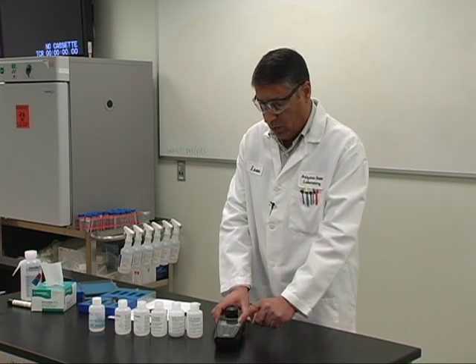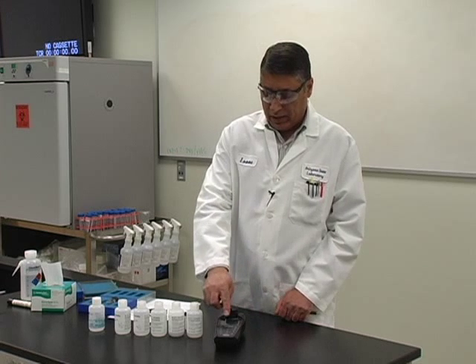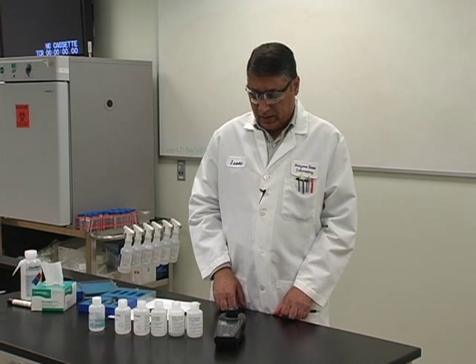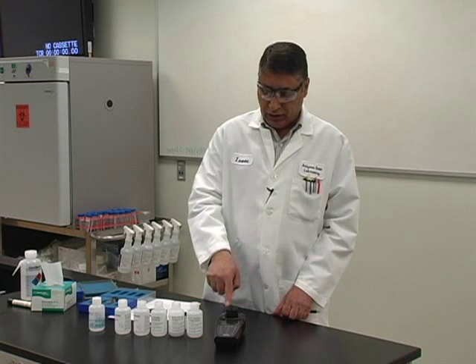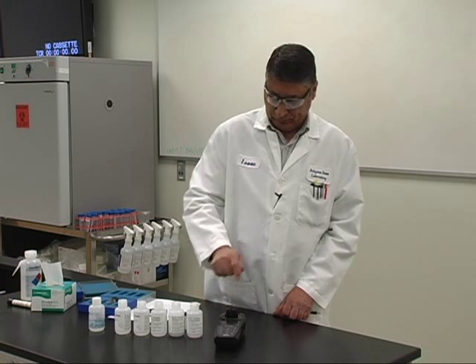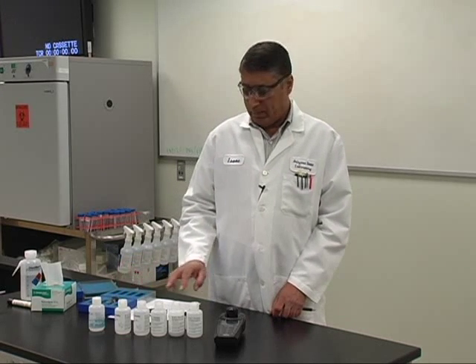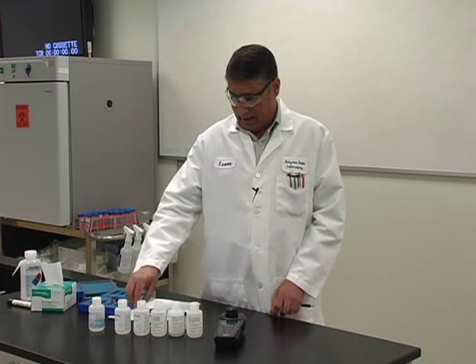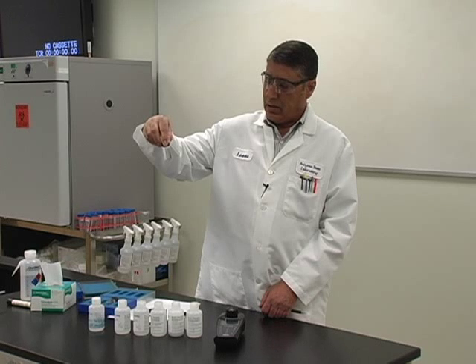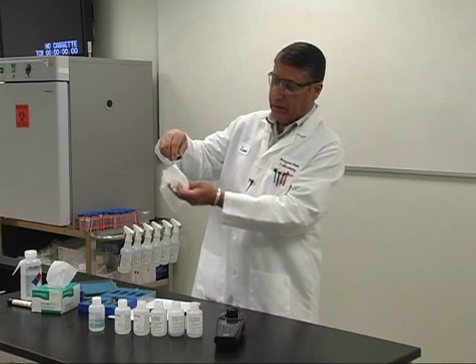Most meters have a calibration mode and a measure mode. To do our calibration, we hit the calibration mode. Let me turn on the power — we are using EPA 180.1 method. The meter is asking me to insert the water blank. I've already poured all the blanks and standards into the vials so that it doesn't take too long. Before you put the vials in the meter, make sure there are no scratches, smudges, or fingerprints on the vials. If they are dirty, you can use a lint-free wipe to clean them up.